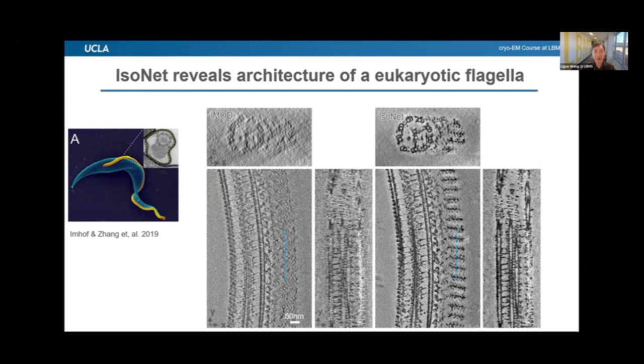Since here, for example, on this slide, near the equator, in the loss region, we can see this information from the IMOD part, but on the right-hand side you can see it much clearer. So I'm wondering, if you just use the denoising, will the loss region be similar?